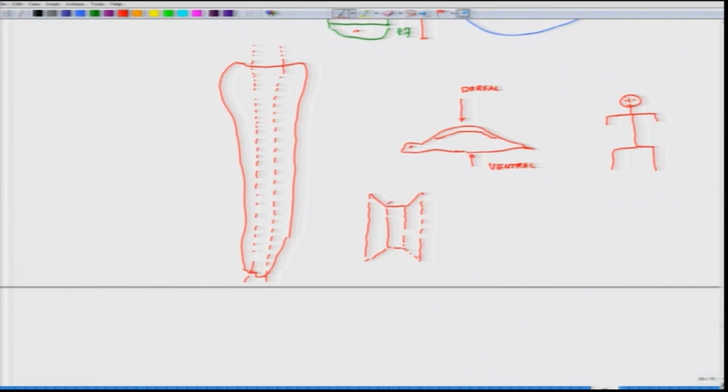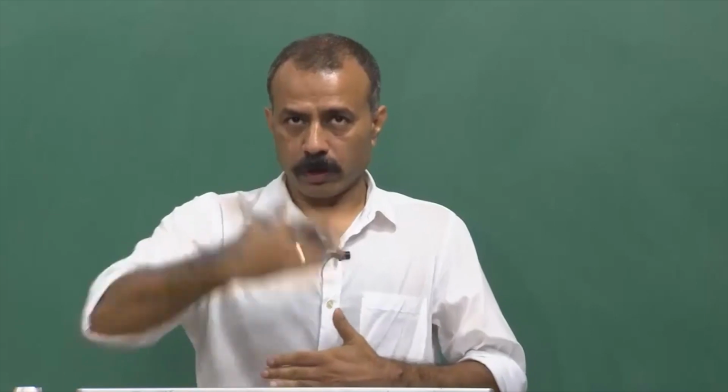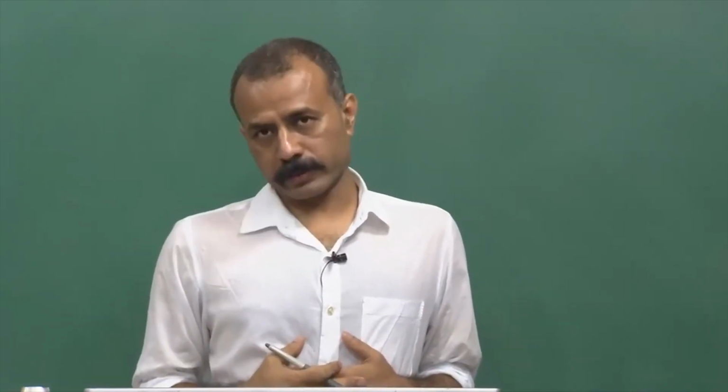So, this is a kind of central part, this is the side and this is the other side. Now, these two sides fold outward. In other words, if this is the ventral horn, you are looking at me from the ventral side, and if I keep it like this, it will be folding only like this.